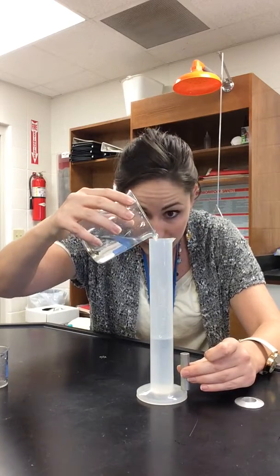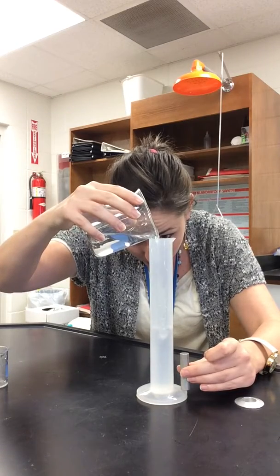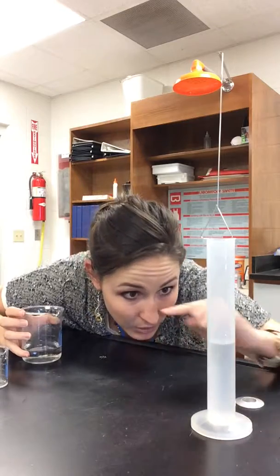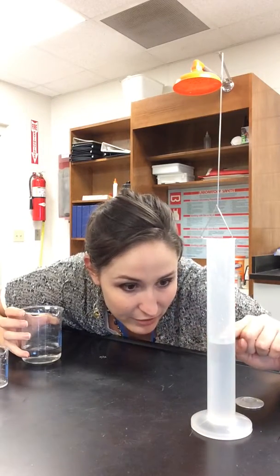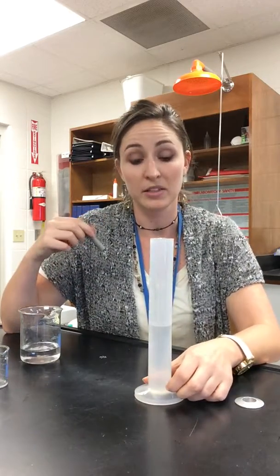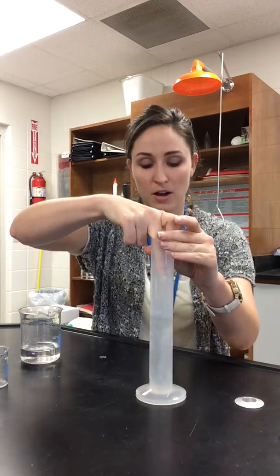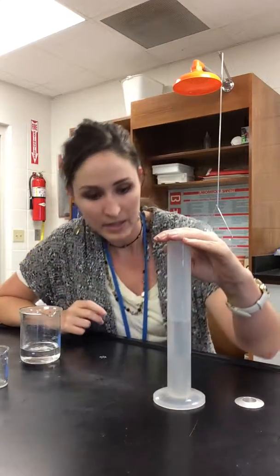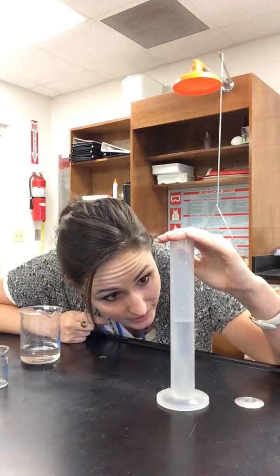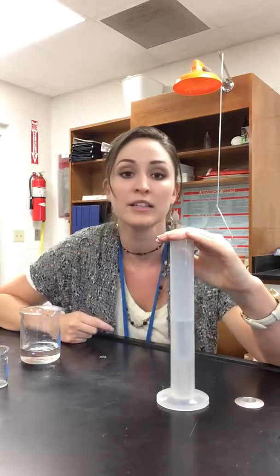So I'm going to pour this to about 60. I'm reading it at eye level. Really mine's at about 59 milliliters. So if I start at 59 milliliters, and I'm going to drop my object in here, and I read it, I see that it has risen to 66.